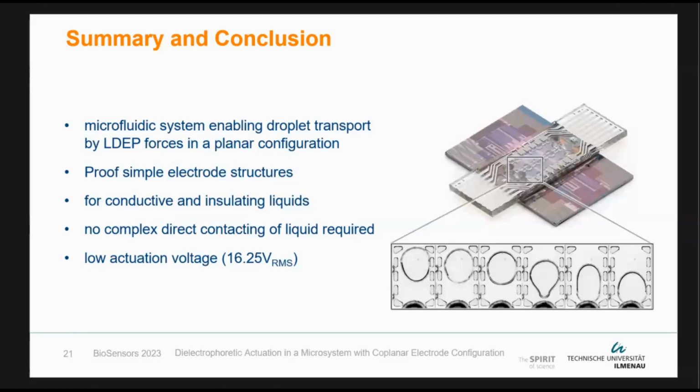And these can be used fully flexibly with any system, as we can incorporate all our fluidic components in one simple design. The actuation voltage is quite low, and as I've mentioned, this can be decreased even more just by more optimization of the dielectric layers and also the shape and the voltage that we are applying, and the frequency, which is something I'll focus my research on later.